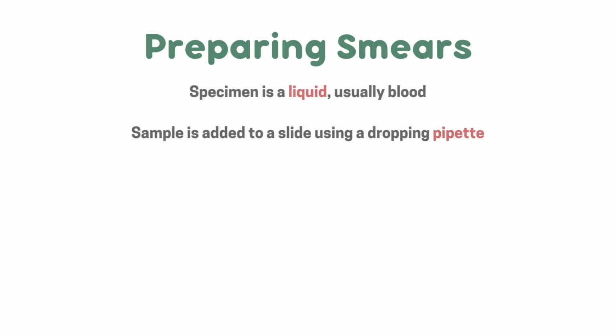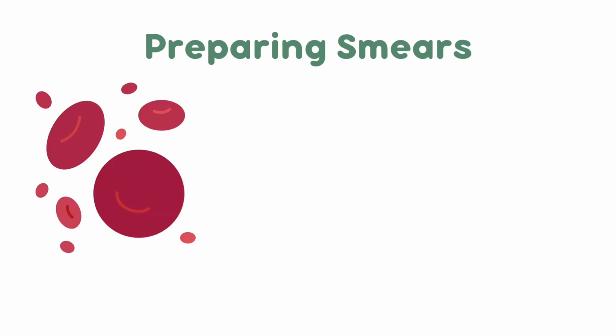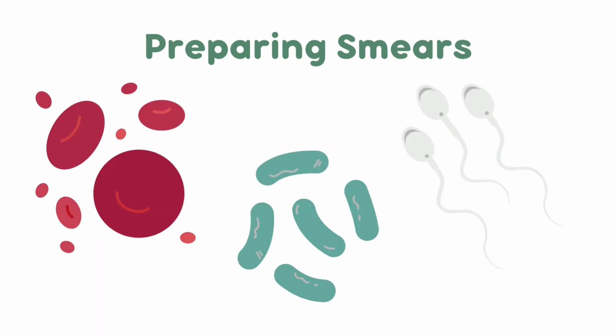Now we're going to look at preparing smears. The specimen is a liquid and it's usually blood. The sample is added to the slide, usually with a dropping pipette. Another slide is used to spread an even coat of the sample across the original slide. Water is not used, but stains usually are. Smears are usually used for blood samples, semen samples, and microorganism samples.